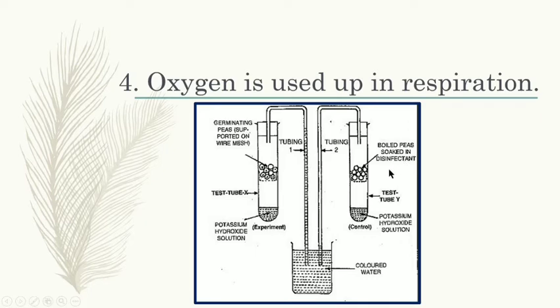Now the second question arises: why are we using the disinfectant here? Disinfectants are solutions in which these seeds are washed in order to avoid any kind of fungal or bacterial growth, as they may interfere with our result.